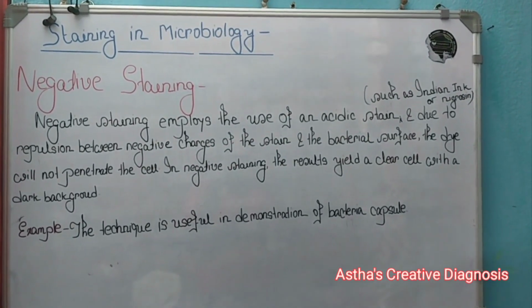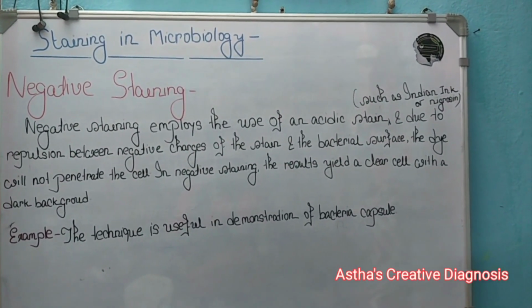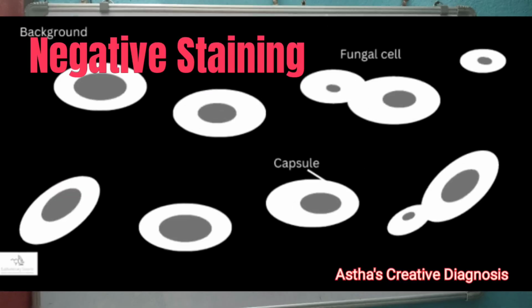Negative staining. Negative staining employs the use of an acidic stain.